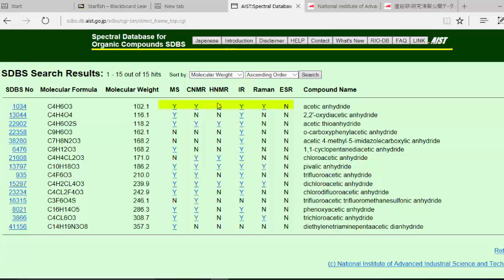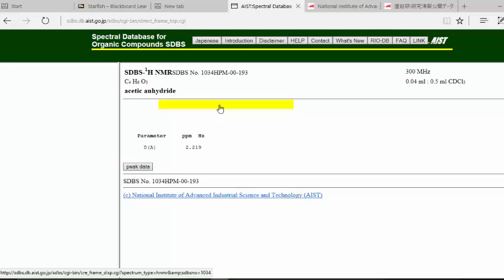Mass spec, carbon, proton, infrared, and so on. So you click proton NMR.